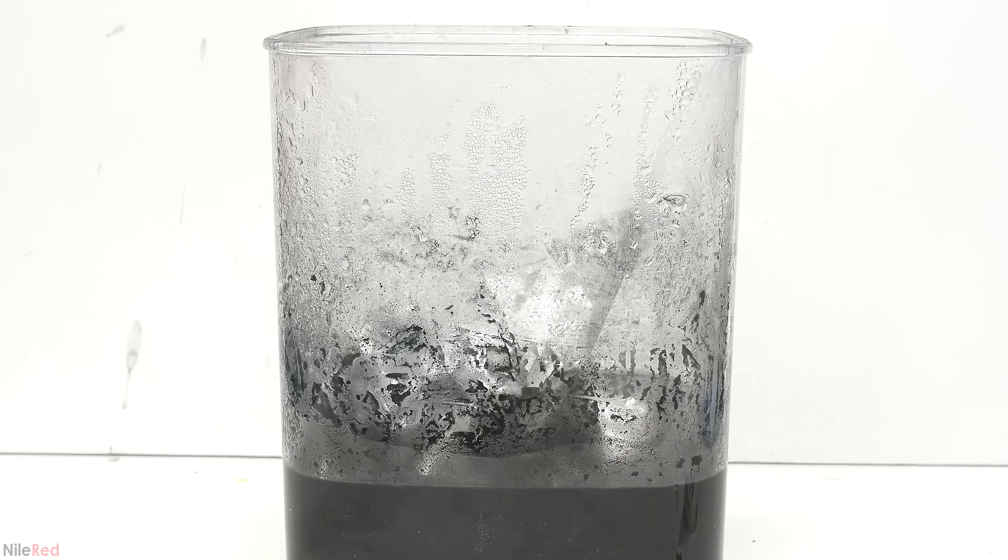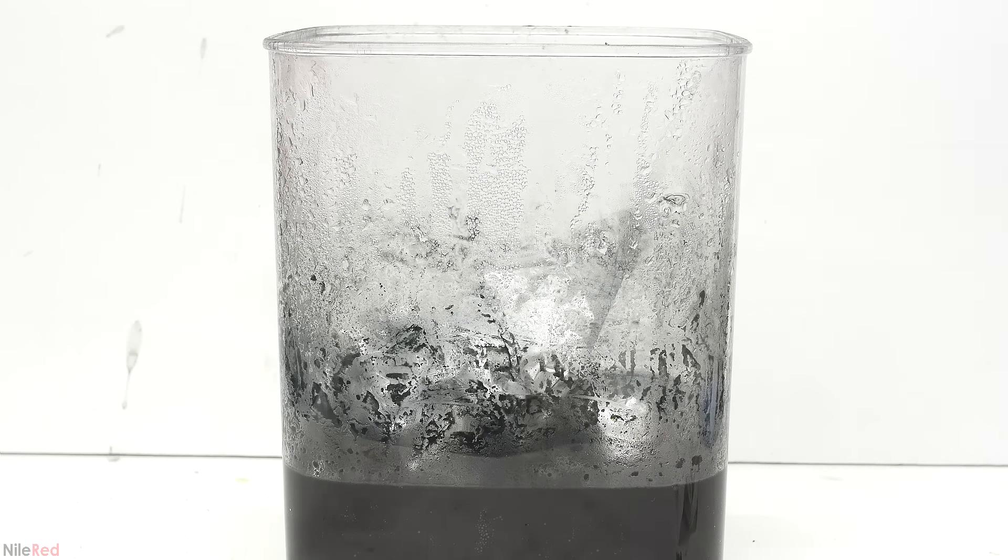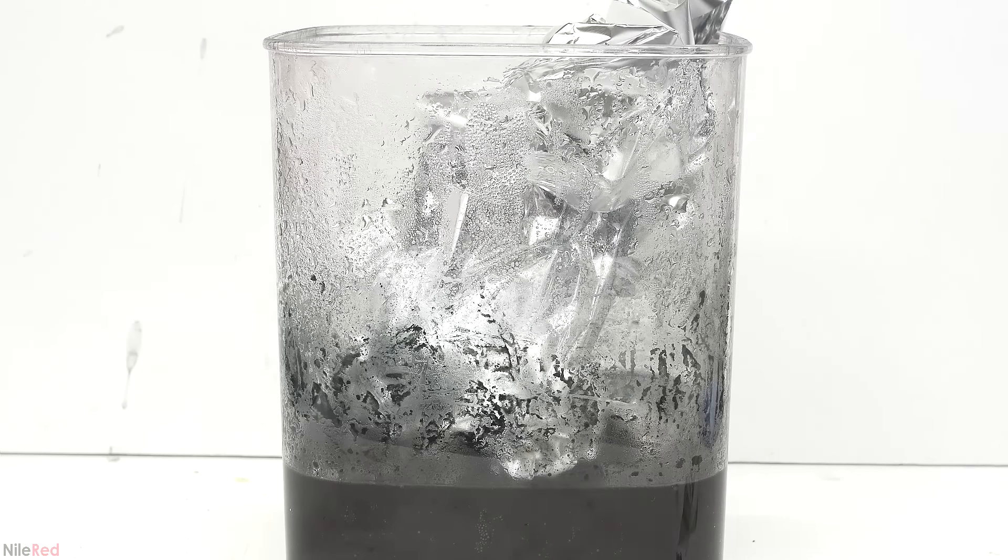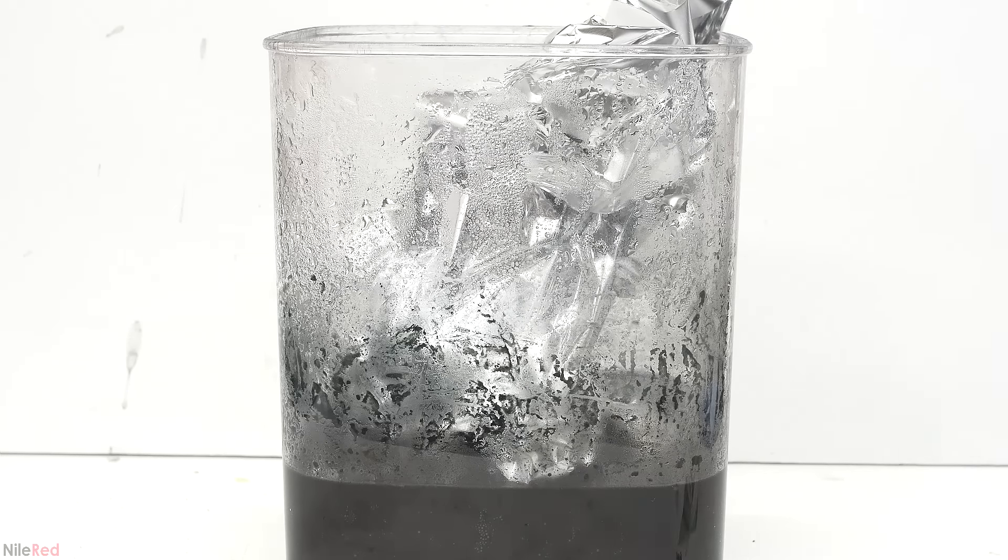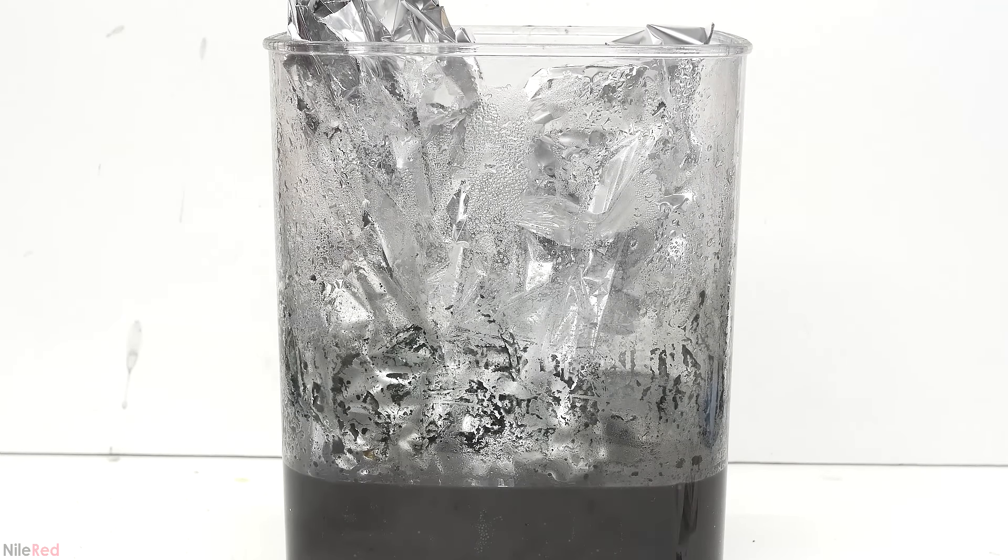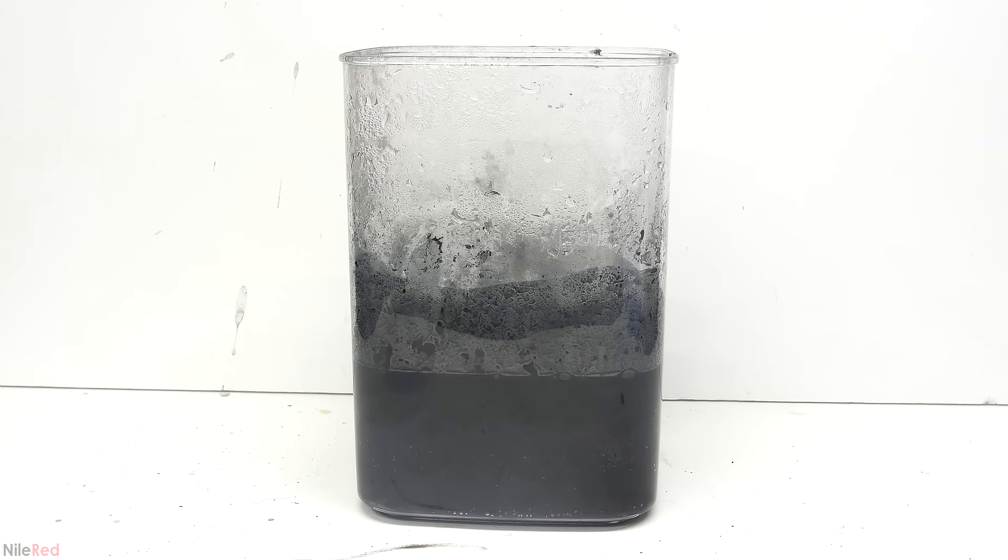With red cinnabar we have a visual cue, because when we're done we shouldn't be able to see any cinnabar left. However, with the black stuff it kind of mixes in with the goo that's formed during the reaction, and the end point is really hard to tell. To make sure I was done, I just used a huge excess of aluminum, probably three or four times the amount that I needed.